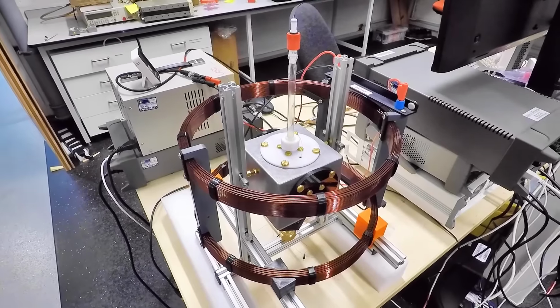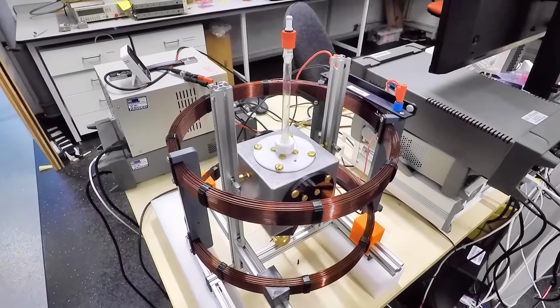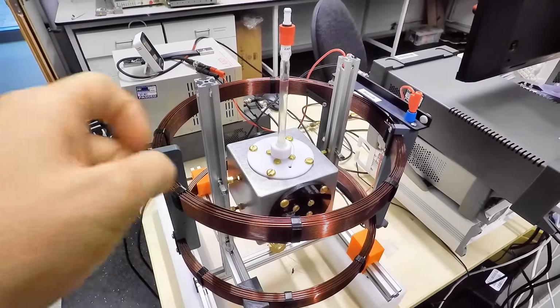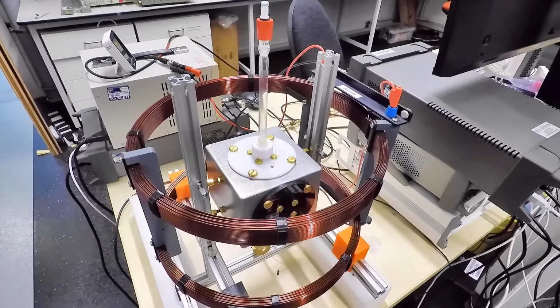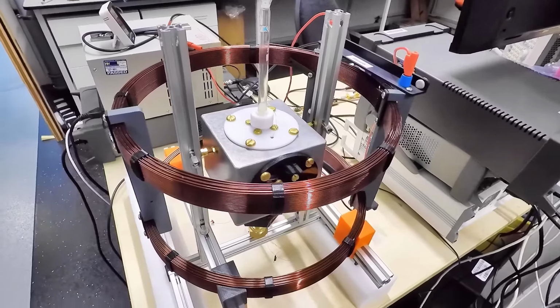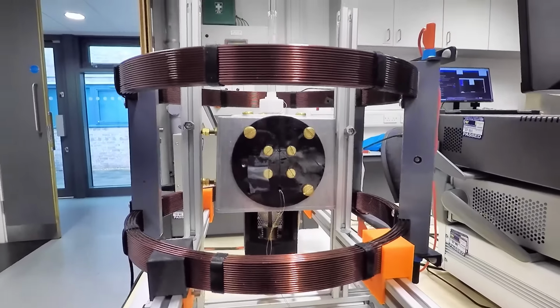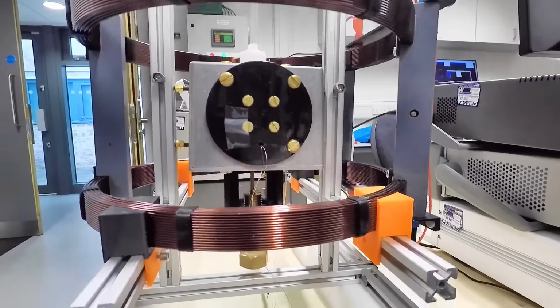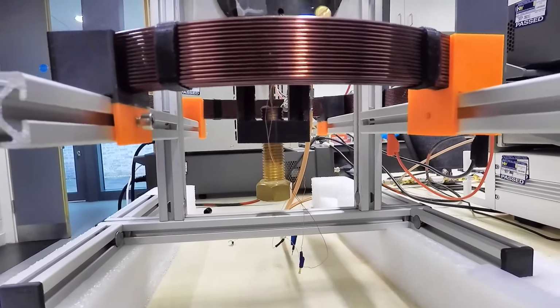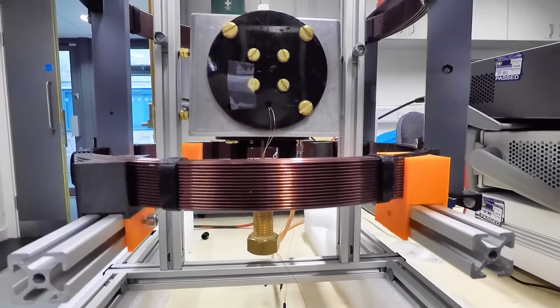So here is the apparatus itself. You can see the large coils there are our Helmholtz coil setup, connected to the DC supply via connectors on the right. The vacuum tube there, you can see, is inserted into a cage in the centre of the apparatus, and everything is suspended from an aluminium frame. Moving down there, we see the central cage, which contains our modulation coils and sample, and at the bottom here we have an adjustable differential screw which we made here at the university, which is what moves the coupling loop up and down in order to critically couple the resonator.